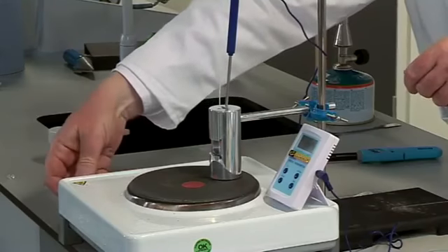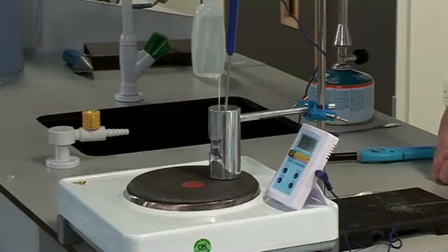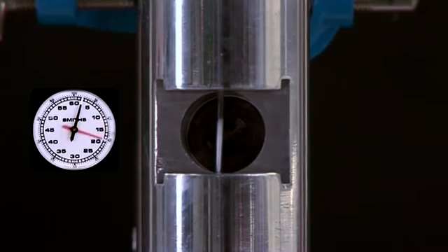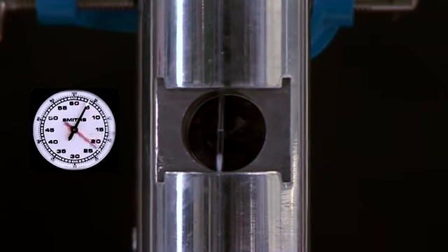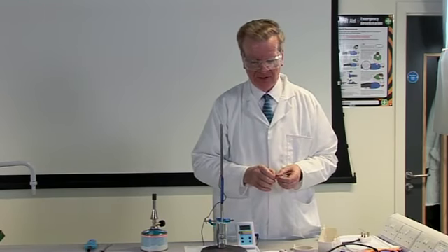Turn on the hot plate and observe the crystals until they melt, that is, until they turn to a colourless liquid. Note the reading on the thermometer. This is the melting point of the benzoic acid. Allow the aluminium block to cool and repeat the experiment using a second sample of benzoic acid. Take the average of the two readings as the melting point of the benzoic acid.